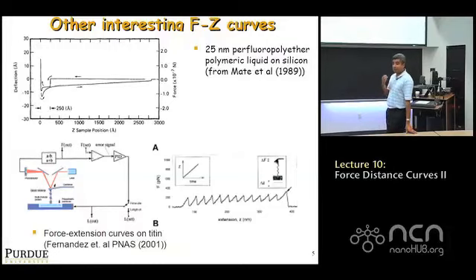So, Capella and Capel, and Butt, they really lay out very specific terminology. They call it Z piezo displacement. In the literature, you'll see the Z referred to by all kinds of names. Some people will call it gap, tip sample gap. It's not tip sample gap, as we've discussed. Tip sample gap is D, right? But some people will call it, in this case, sample position.